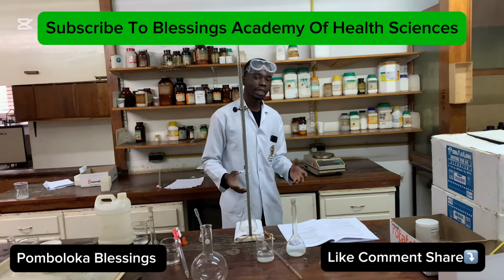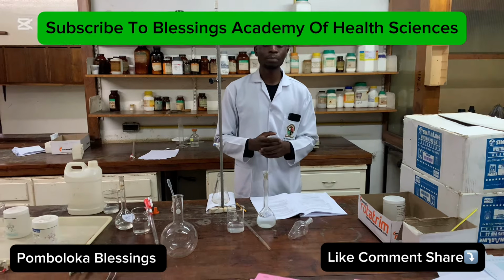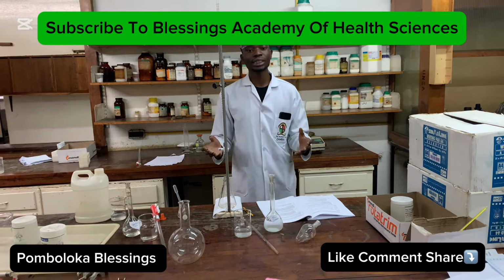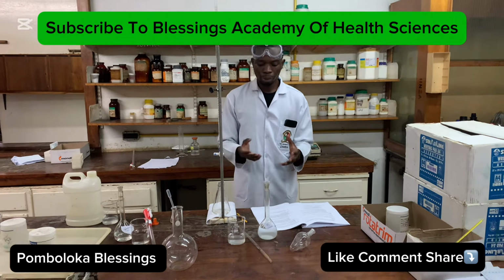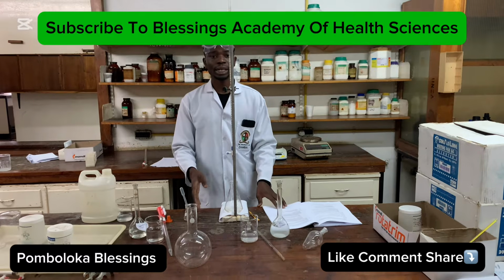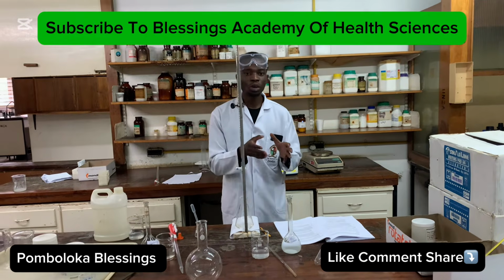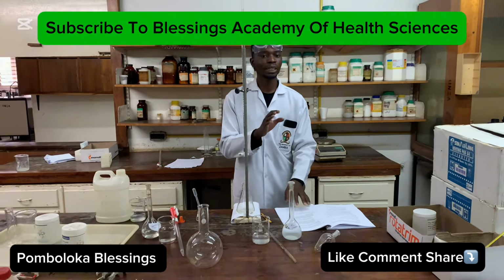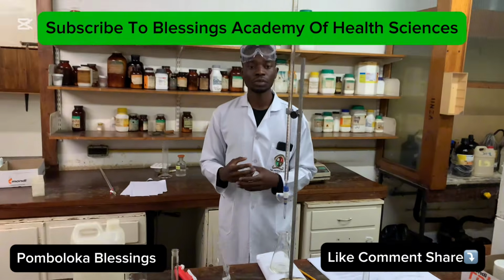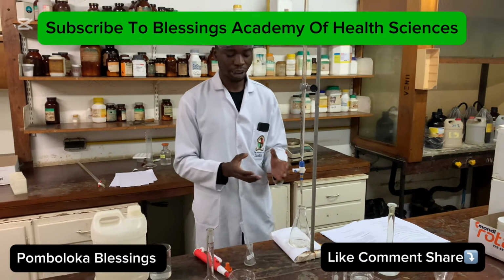So remember, in the first part of the video, I mentioned that what we have there is the ammonia plus the HCl. The ammonia is the limiting reagent, and the HCl is the one that is in excess. In the first part of the reaction, the ammonia reacted with the HCl to give us ammonium chloride. Since the ammonia was the limiting reagent, we expect that we're not going to have much of the ammonia in the chemical reaction, but what we're going to have is the HCl, which is going to react in the second part of the reaction, which is this one right there.